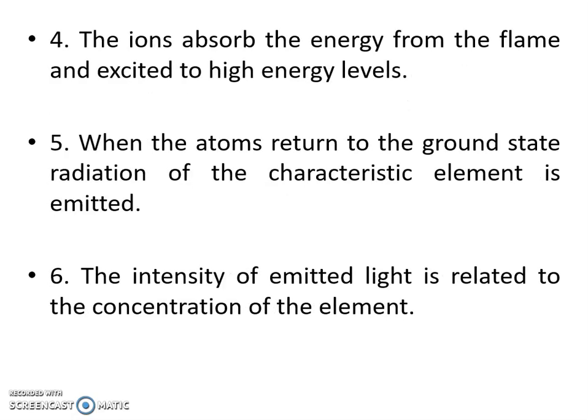The ions absorb the energy from the flame and are excited to high energy levels. When the atoms return to the ground state, radiation characteristic of the element is emitted. The intensity of emitted light is related to the concentration of the element.